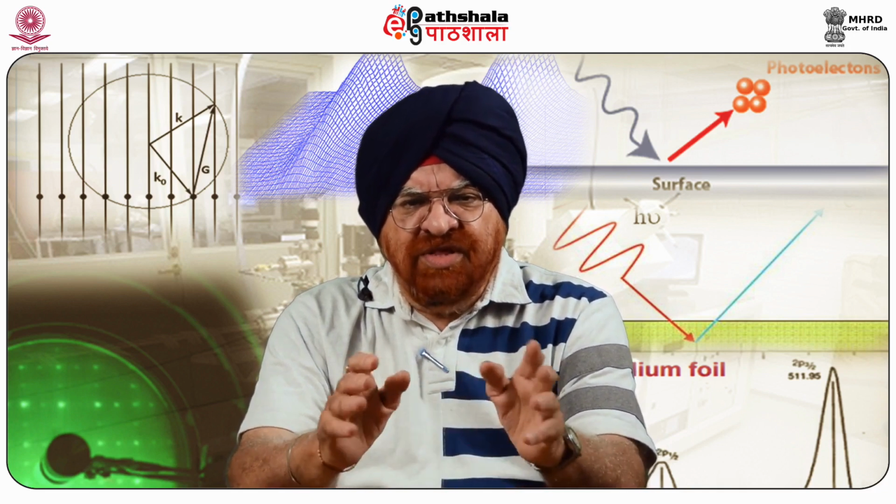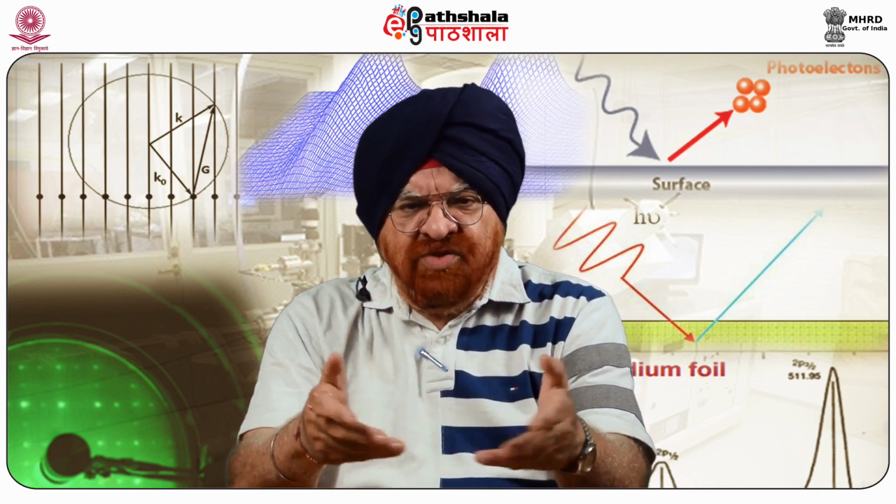So students, having talked about the introduction, and having come over to the stage which deals with the instrumentation, we can now very conveniently summarize what you have learned in this module. Since it is dealing with instrumentation, I'm sure you would have picked it up very easily, as the electrons used for HREELS spectroscopy are of low energy.